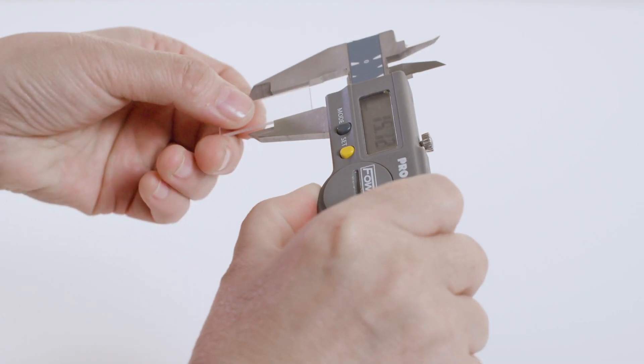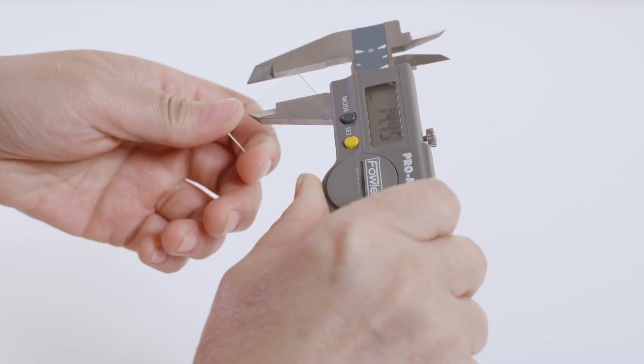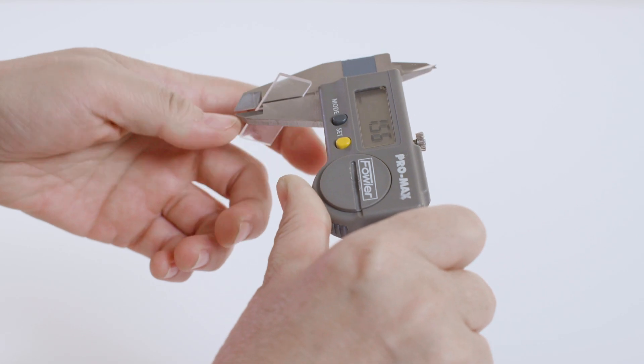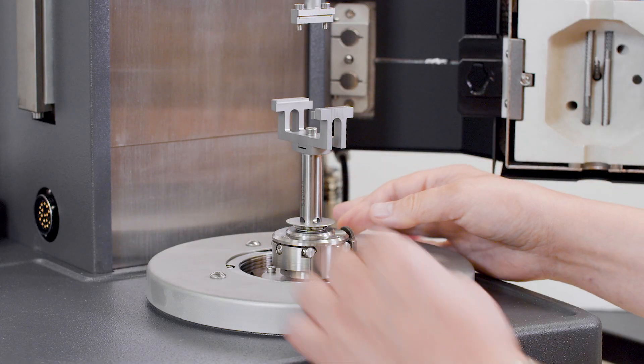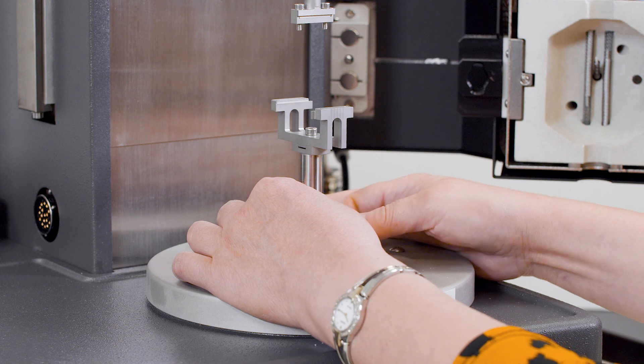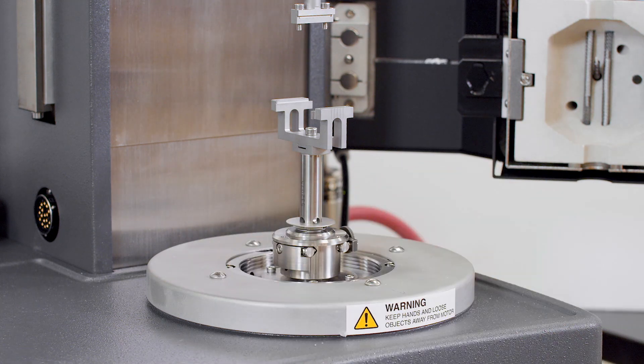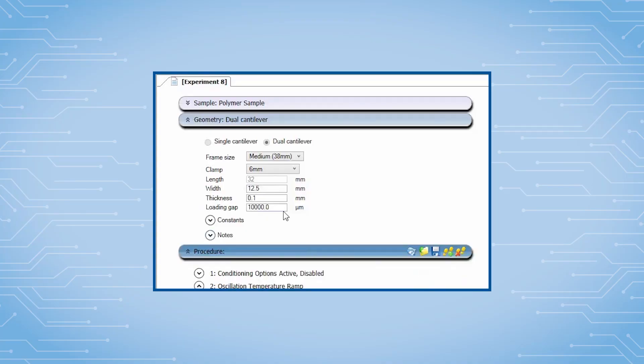Use a caliper to measure the sample width and thickness. Select and mount the appropriate frame size for the measurement. Enter the sample dimension into the geometry file in TRIOS.